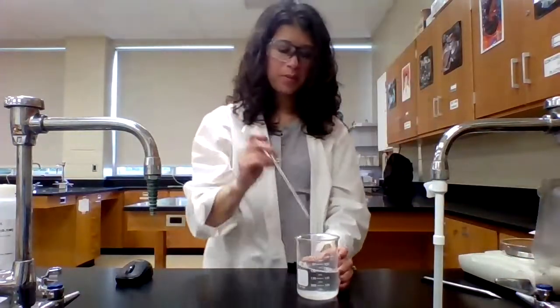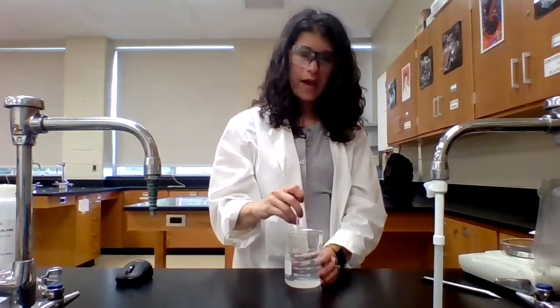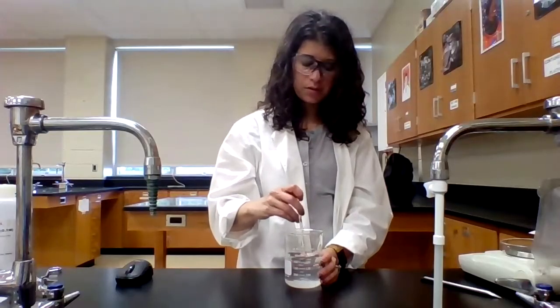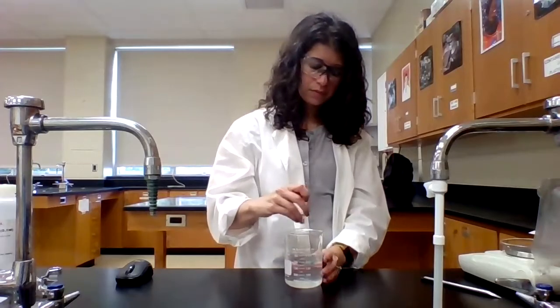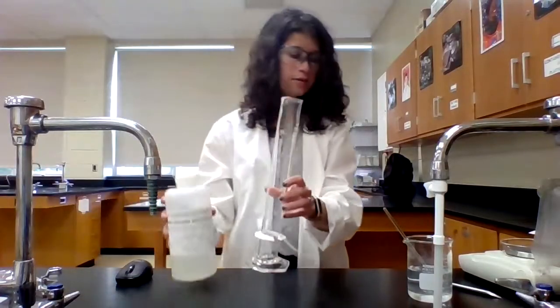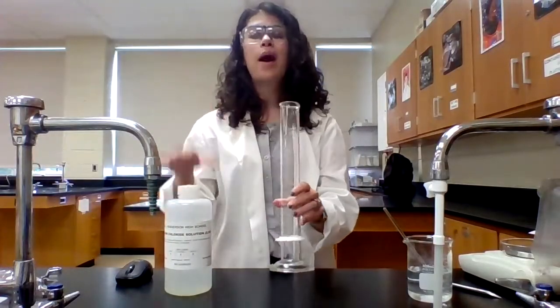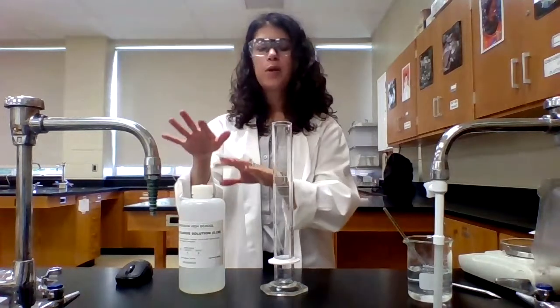And then I'm going to take my stir rod and just make sure that all of that group 1 carbonate has dissolved. Let it sit there for a minute. And then while that's still stirring a little bit, I'm also going to measure out the calcium chloride solution. Again, I don't need a precise volume.